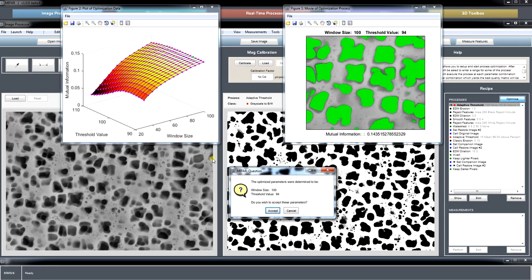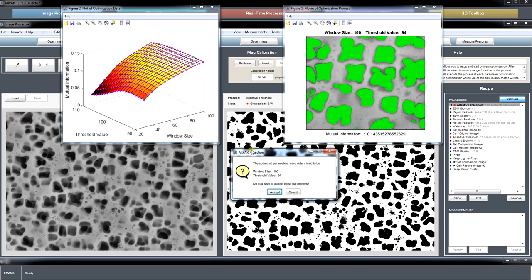So again, because what you're doing is comparing your segmentation to the image, not to the unknown microstructure, you have to take into account what the microscope has done to the image, and you may need to make some modifications to the comparison image that make the image better represent the microstructure that you know you're trying to find.